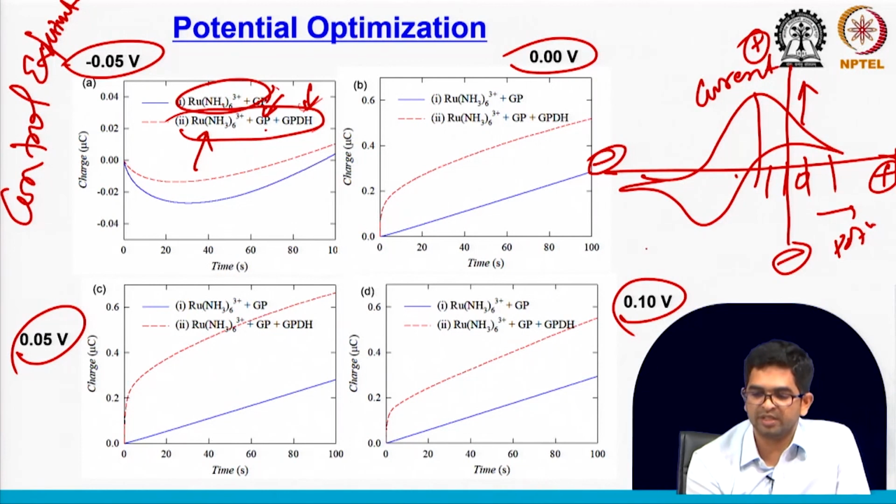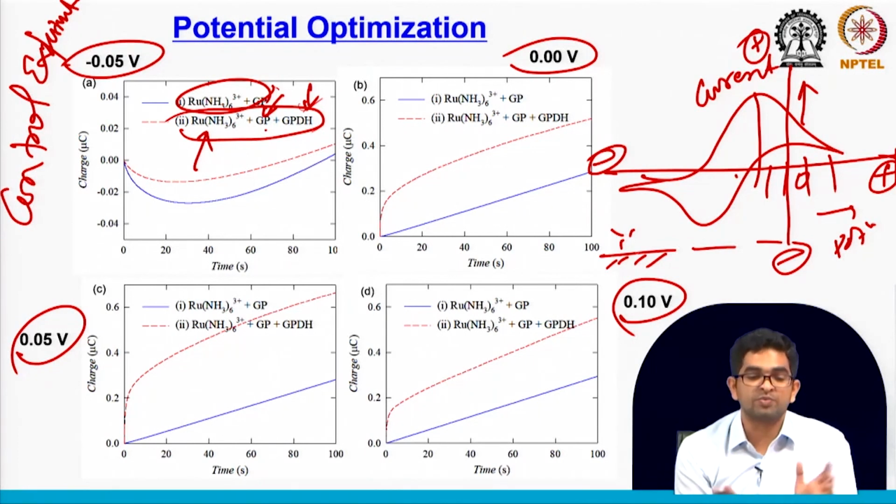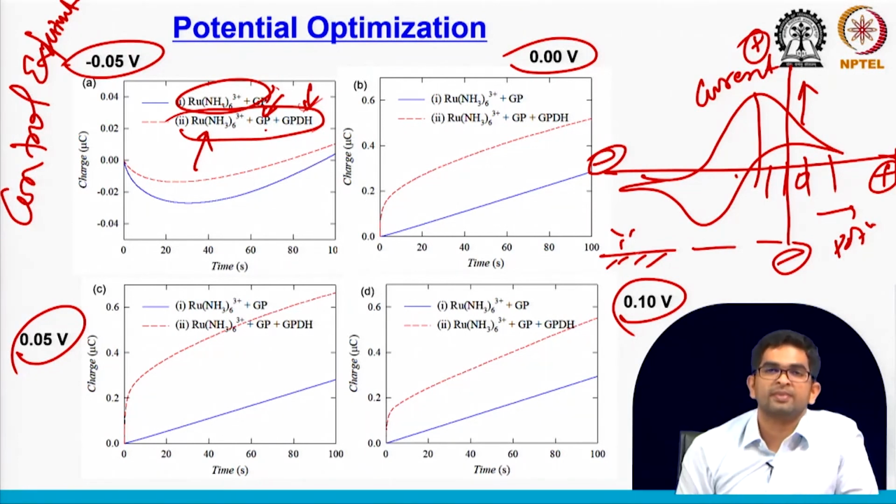You can think about this as just a bare surface without antibody coated also. You just think of the bare surface. Let's run some cyclic voltammetry. Let's run some potentials, and let's get some idea of which potential can be the best for this wash-free biosensor.